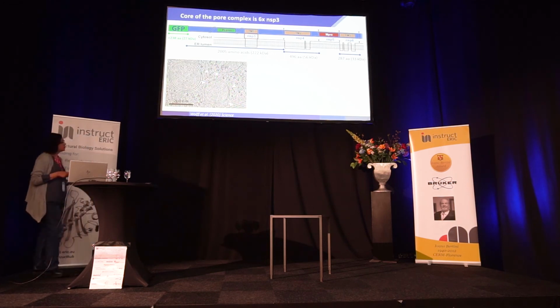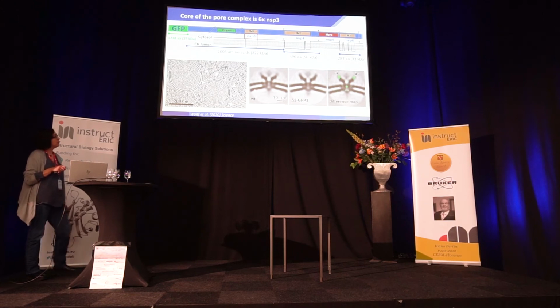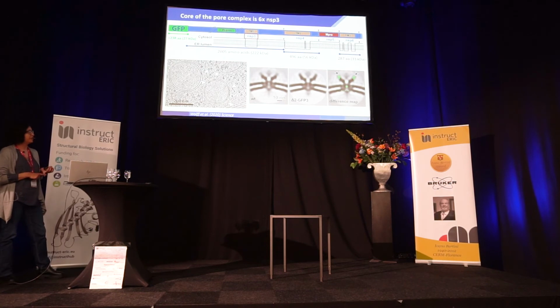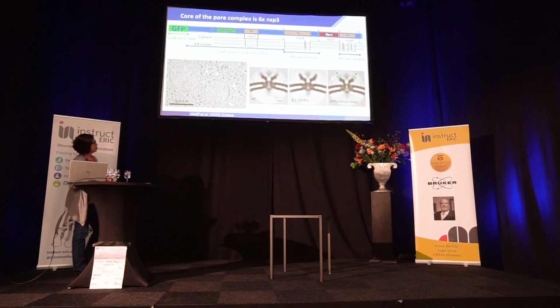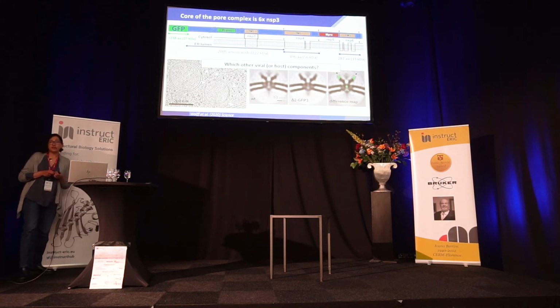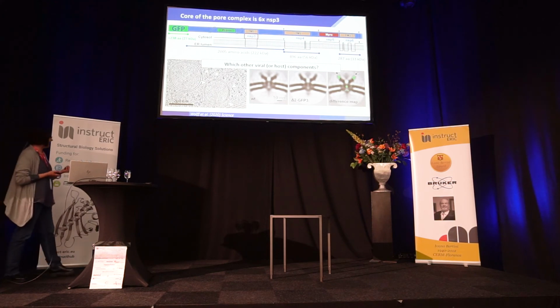These DMVs also contain pores. We boxed them out, did subtomogram averaging, and when comparing the new structure with the wild type, it becomes apparent that there are some extra masses in the prongs of the cytosolic crown, which are more obvious in the difference map. This was very important because it first confirms that copies of NSP3 are components of the core, but it also gives us a hint about their orientation, with the cytosolic part facing out, with the N-terminal domain in the prongs of this crown. I must say that these six copies of NSP3 only account for about 50% of the total estimated mass, so there must be other viral components in the core, and we don't know what they are yet.